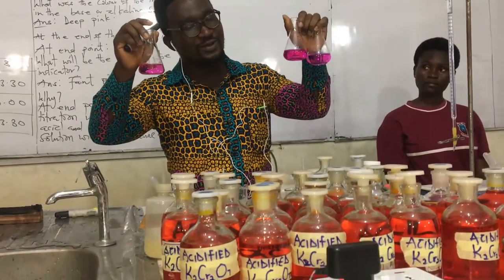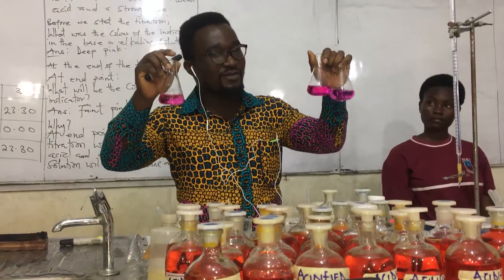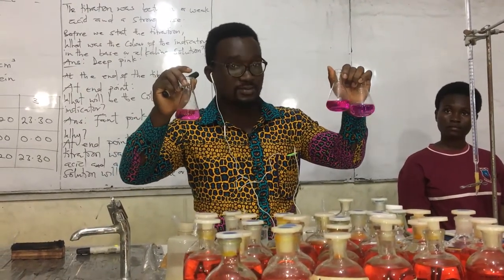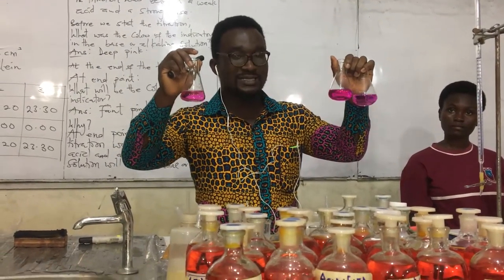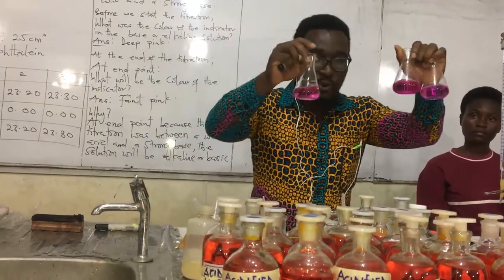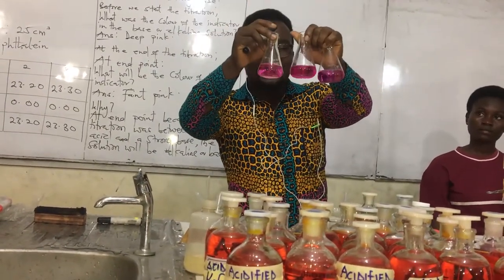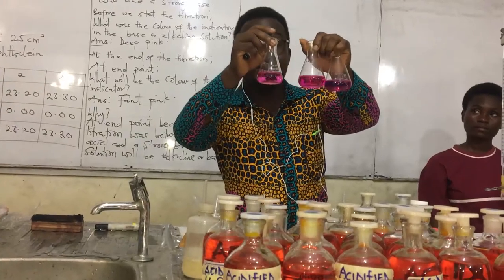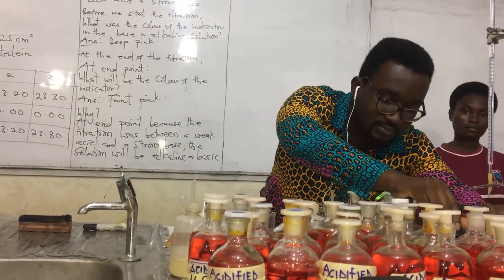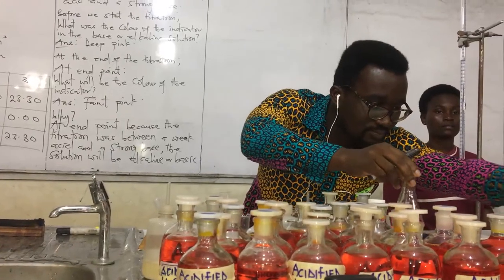When you go to university, you are going to find it very difficult because there you'll be expected to do everything in a precise manner, not just accuracy. Because in science, we respect precision. Good, so you can watch it once again. That is the color which is expected. It was very deep. It has gone to faint. So that is it.